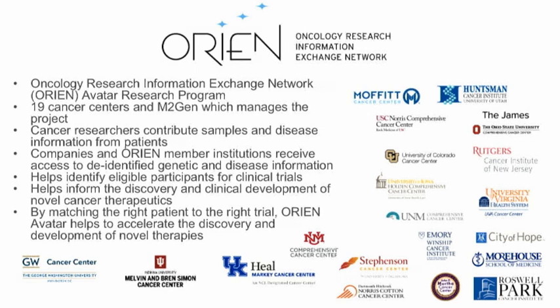But the idea is a unified molecular platform to analyze a quite high diversity of tumor and matched normal samples from patients. And basically, it's deep exome sequencing on the tumor, about half the coverage on the normal tissue, and then RNA sequencing on the tumor as well. And I'll get into the details a little bit more.